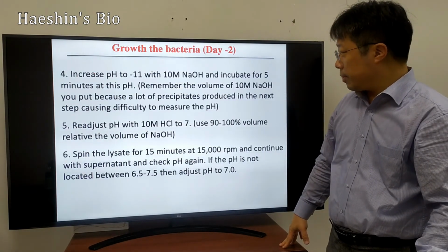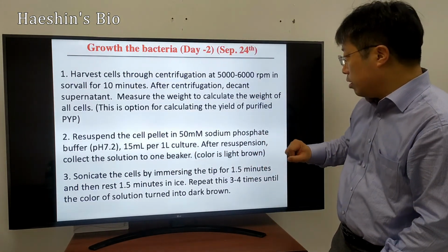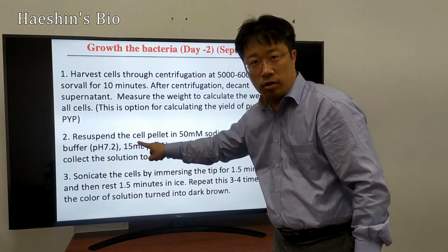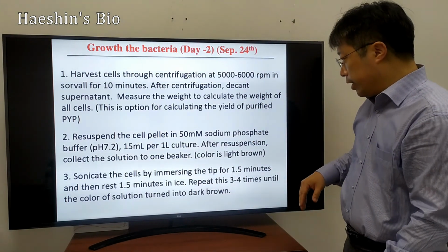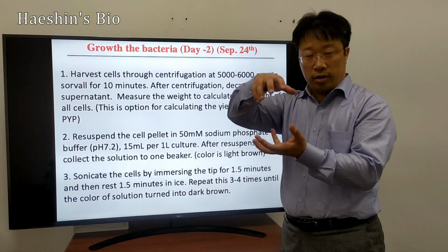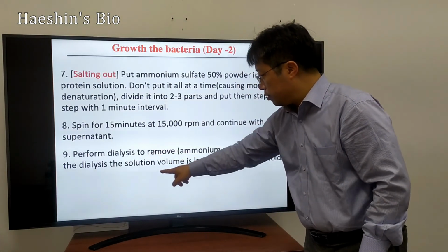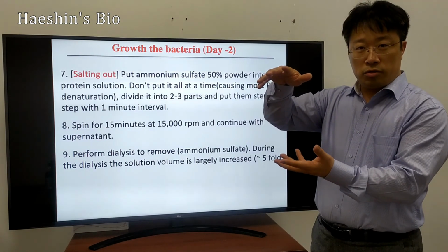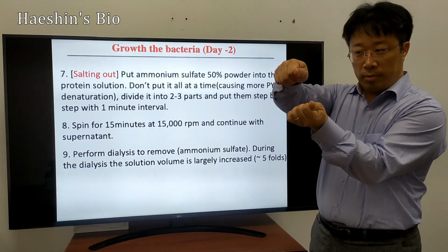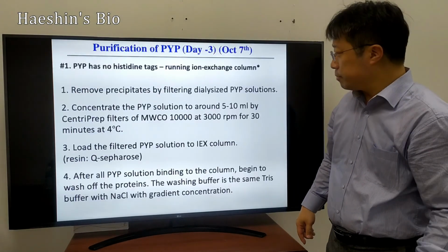So imagine that we are actually dealing with about 1 liter culture of the E. coli, that we add about 15 milliliters of this volume, and then we might have about this volume range. You might have to calculate, after this dialysis step, the increase in volume. That would be 30 or 45, so they have to be increased. Otherwise, the membrane will be burst because of the incoming water molecules.